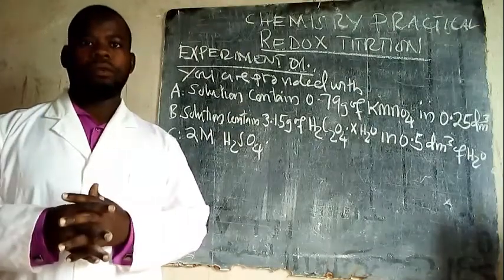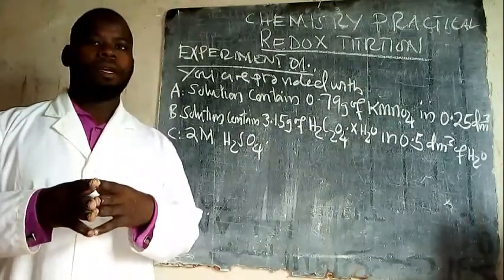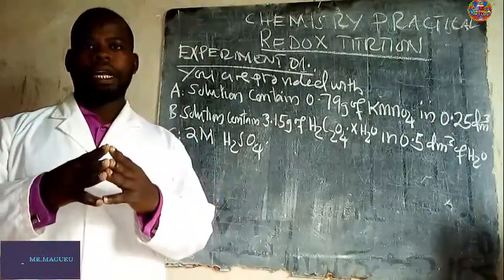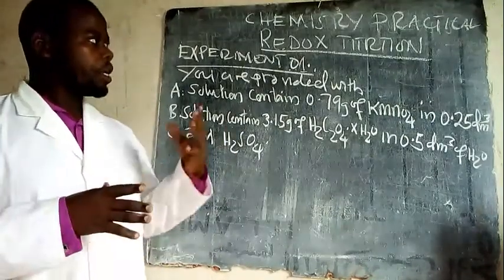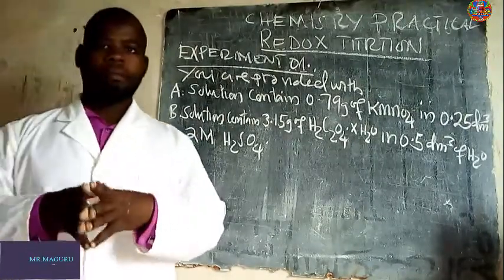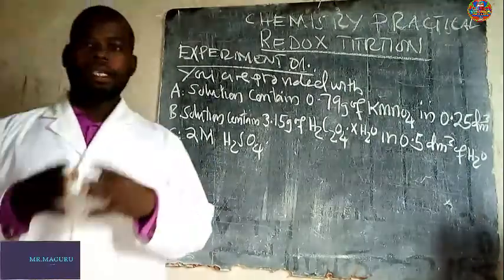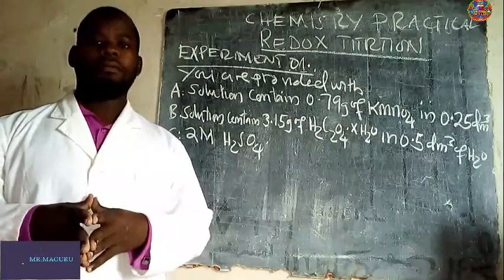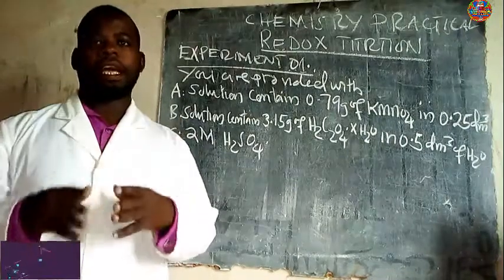For the first lesson, I taught the students how the reactions are going to be shown. In our first topic, redox titration, we learned about the chemical reactions between potassium permanganate and the oxalate from oxalic acid in an acidic medium. It means in this redox reaction, you have to perform the titration with an acidic medium by adding sulfuric acid.